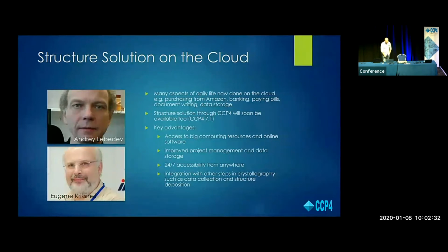It also includes storing all your data. You don't have to worry about file upload and that. Once you upload initially, everything is done online. It's accessible 24 hours a day, 7 days a week, and from anywhere that you have Wi-Fi, you should be able to access the cloud.